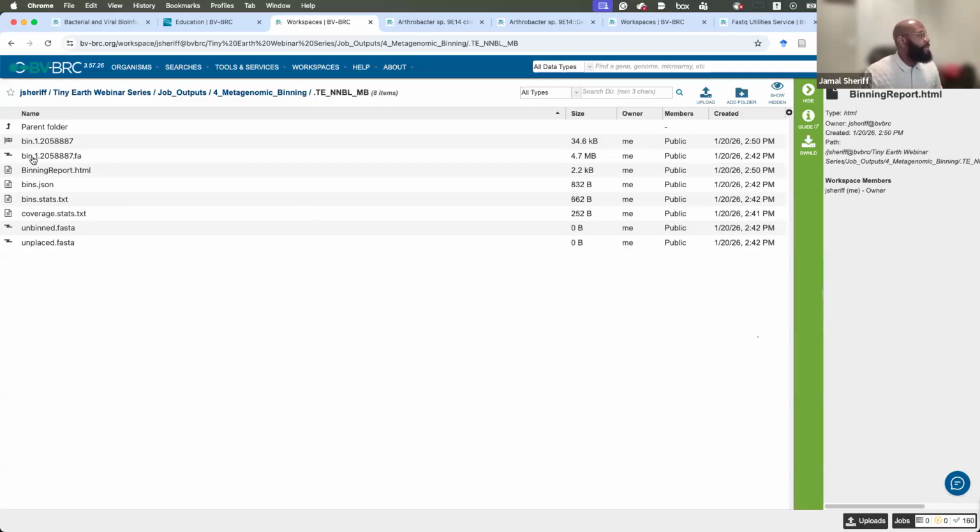All right. Now, you already have a FASTA file, but say you used reads instead of contigs for assembly. Maybe you made multiple bins. This will create FASTA files for each bin that was constructed by this service. Anything that wasn't binned will be added to our unbinned FASTA file.